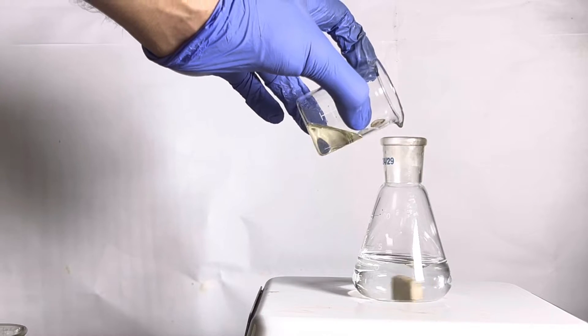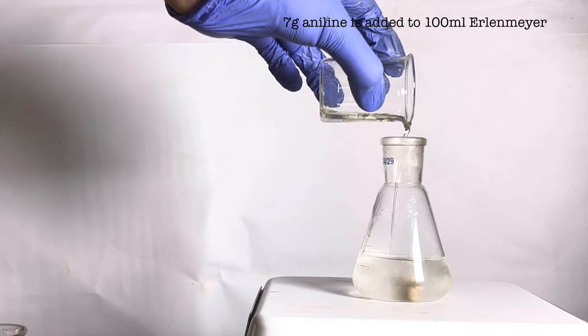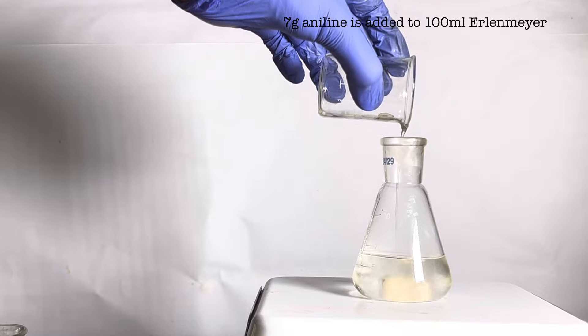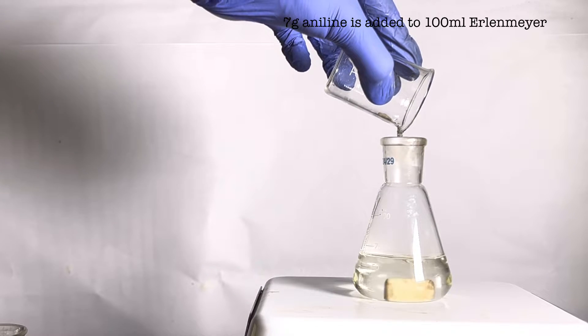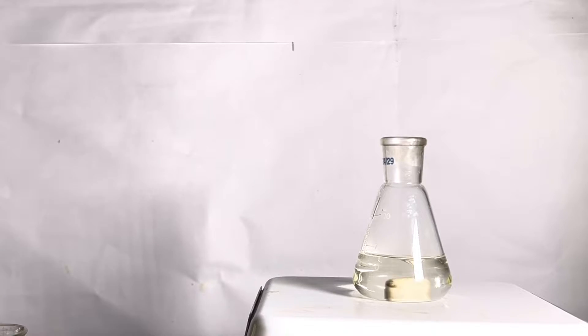Next, 7 grams of freshly distilled aniline was added to the flask. Aniline should be freshly distilled, otherwise the solution appears dark due to the presence of impurities. Aniline dissolves in the hydrochloric acid forming aniline hydrochloride.